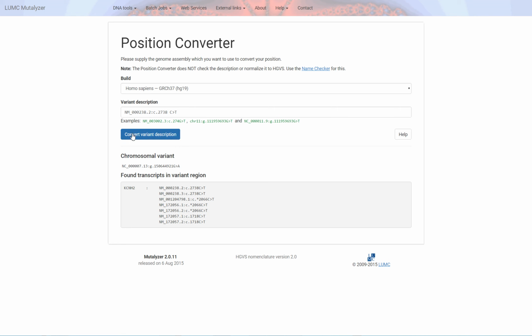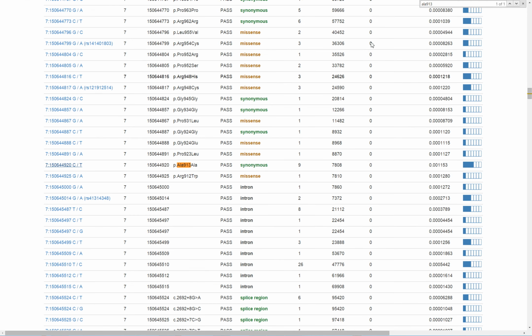Using the same methods as before, you plug in the variant location to find out whether or not this specific variant is present. Now, since we searched and that location was covered this way, I'm presuming it's going to be the same, but let's go ahead and just double check that. And so it does not appear as though that specific variant was reported based on the genomic coordinate.